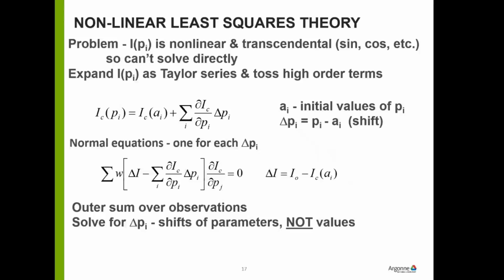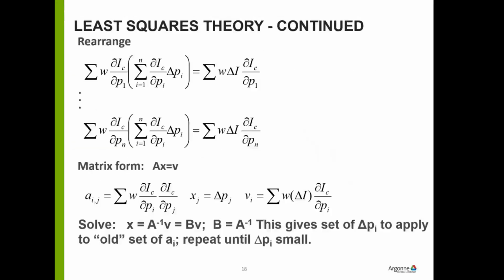If it was regular linear least squares, like curve fitting straight lines, for example, you don't do it this way. It's by a simpler approximation. Anyway, what you're after is the shifts and not the values. The key point about all this is how those matrices are built.